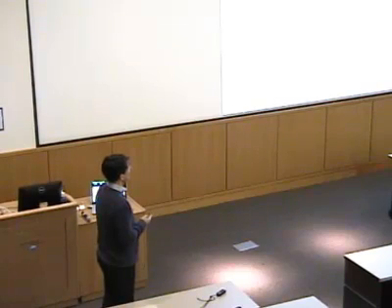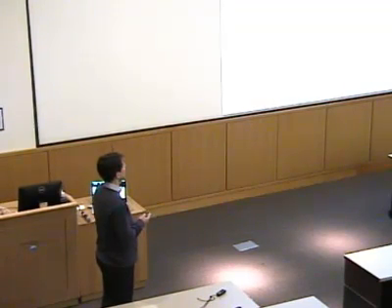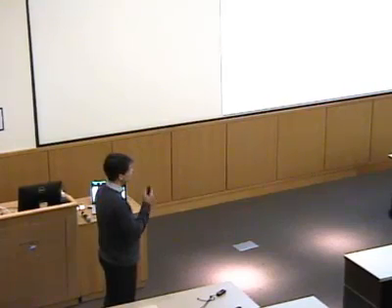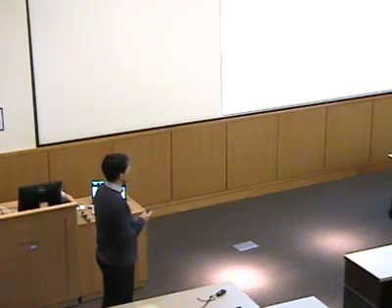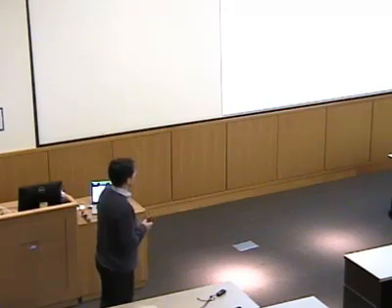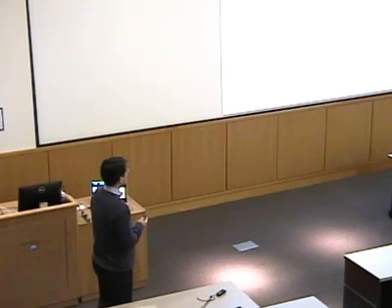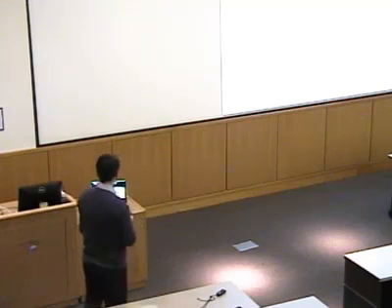Then you're in the domain of EPR spectroscopy, and you flip electron spins. And when you go further down to 10 to the minus 6 to 10 to the minus 7, you just flip nuclear spins, and then you're in the domain of ENDOR and NMR spectroscopy. So you will hear all about that from the colleagues in the lectures to come. And today we zoom into the infrared region of the spectrum, into IR and Raman spectroscopy.